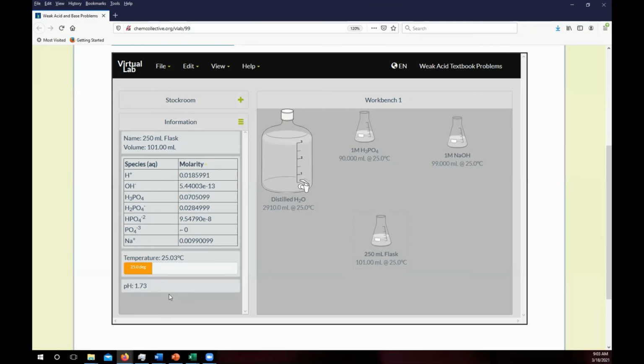In this way, once you have all of those measurements recorded, you can then prepare a titration curve, or a graph of the pH of the solution on the y-axis versus the moles of sodium hydroxide that were added on the x-axis. And from that titration curve, you'll be able to determine the equivalence points of the varying acid-base reactions that happen in the titration.